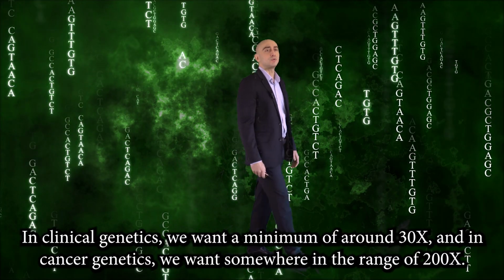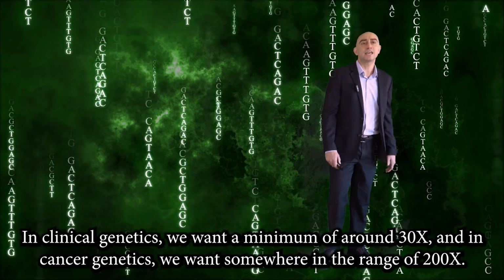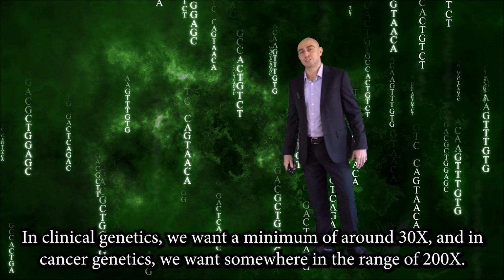In clinical genetics, we want a minimum of around 30x, and in cancer genetics, we want somewhere in the range of 200x.